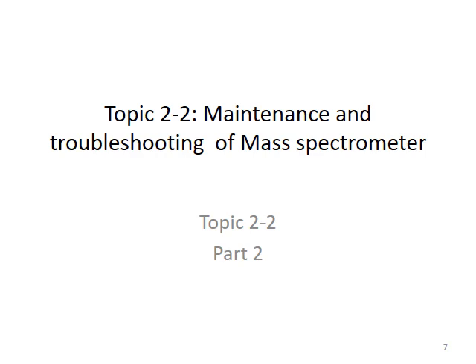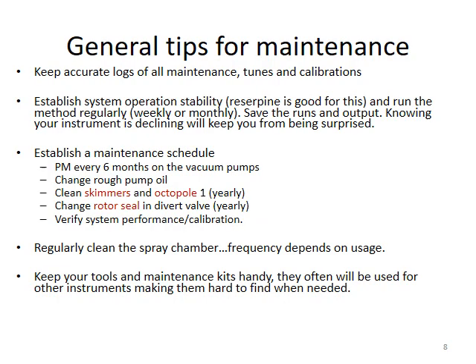So this is the same topic. It serves as a second part for this topic 2.2. In the first part, we have understood the structure of the QTOF. From this slide onwards, we are going to learn some basics, and that will help us to maintain this very expensive equipment.